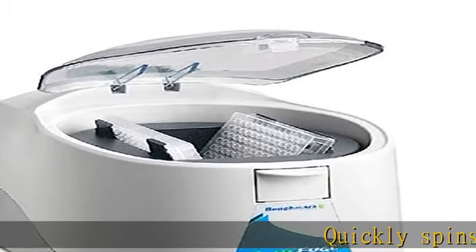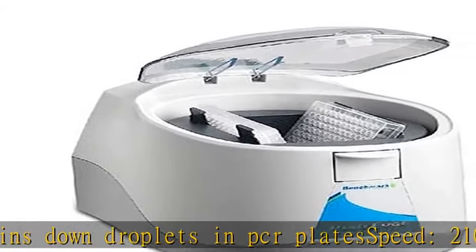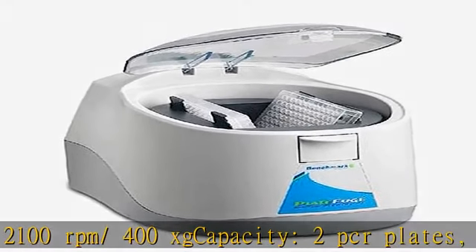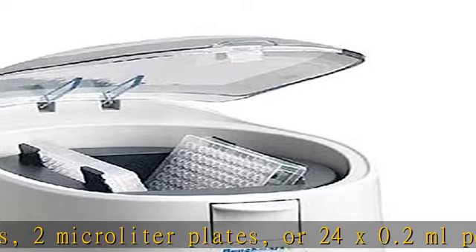Quickly spins down droplets in PCR plates. Speed: 2100 RPM / 400 XG. Capacity: 2 PCR plates, 2 microliter plates, or 24x 0.2 ml PCR strips. Deceleration: 7 seconds. Unique swing-out rotor design prevents spillage — patent pending.